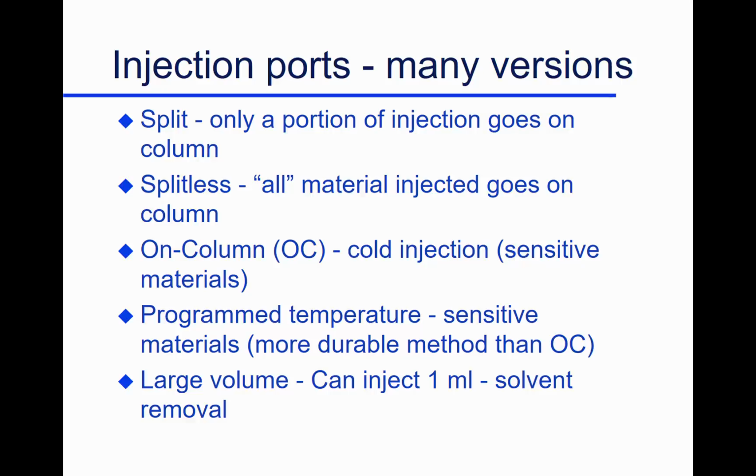What we typically run is a split inlet. By a split injection, the columns that we use are tiny. And again, you've seen this if you've done the laboratory. When you do the laboratory, Cindy or someone will open up the door and show you the column, or maybe you've got one sitting out there. These things are less than a millimeter in outside diameter. The inside is about 0.25 millimeters, so tiny, tiny columns.